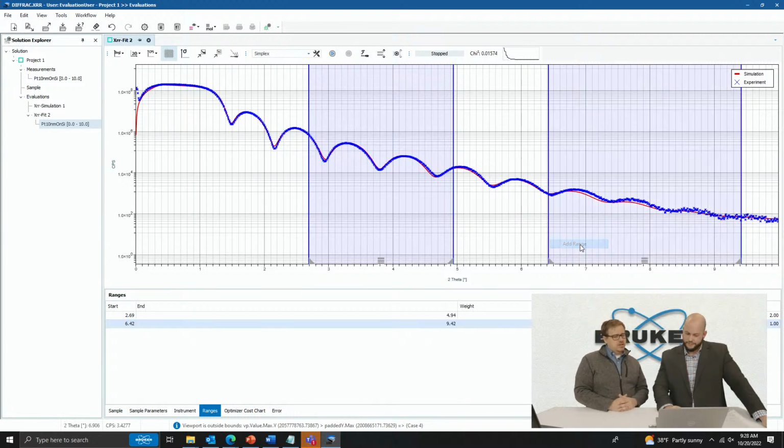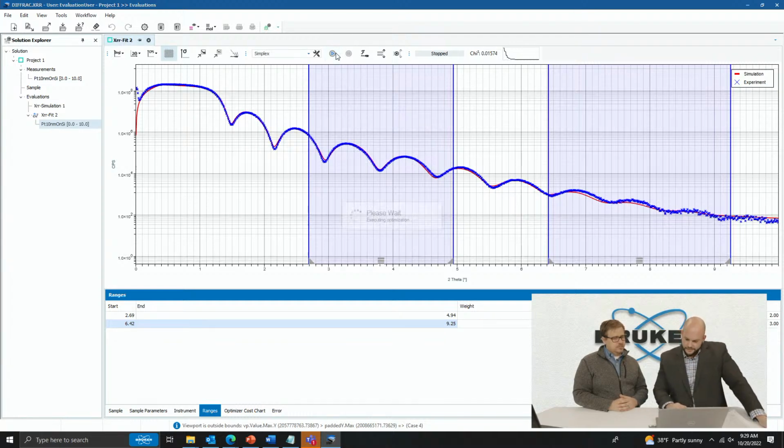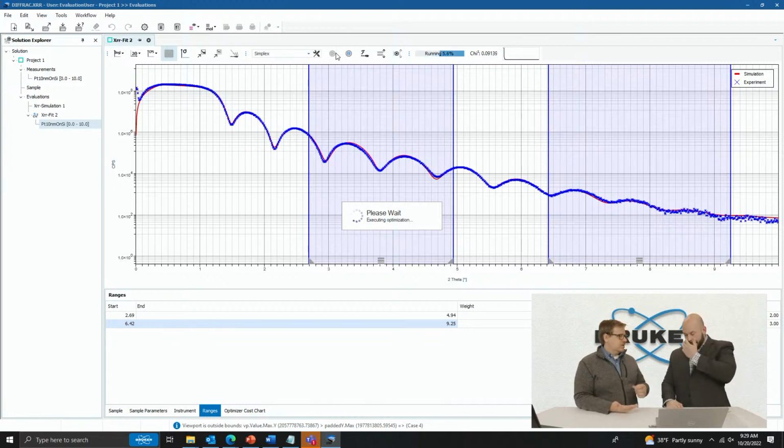So let's go ahead and throw a range for that. That looks pretty good. And we could give this a weight of, I don't know, let's say 2 or 3. Let's try 3. Yeah, there we go. You can definitely see that balancing, and this could be something like just a little oxide layer around the silicon, and you can always play with that. You can try to refine this more.